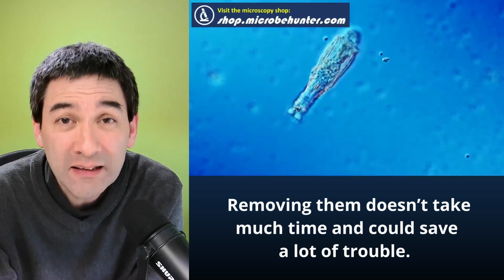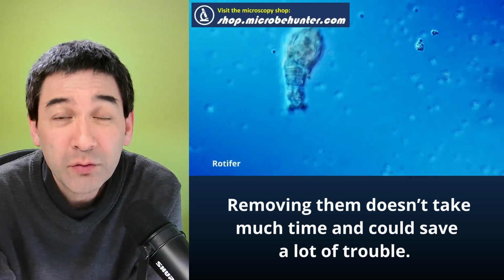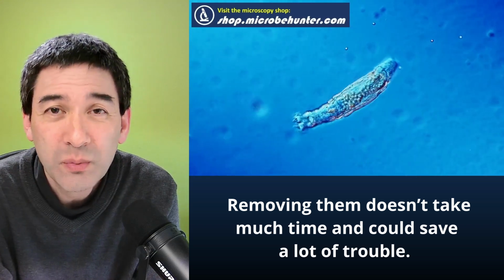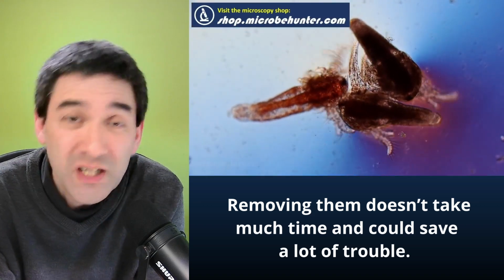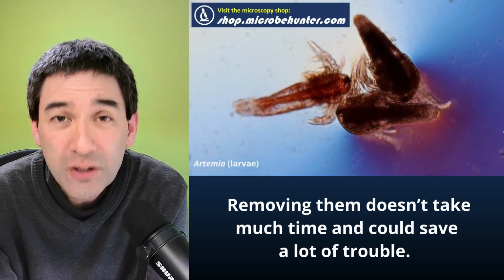But then I know exactly at which place on the microscope slide I want to look. If I remove the other objectives, how am I supposed to find the focus when using the immersion objective? I need the other objectives to actually position the specimen and do all of the preparation work. So this is a little bit of an issue.